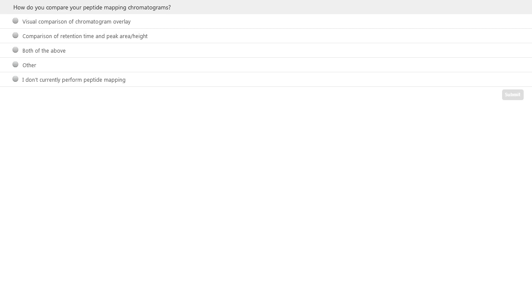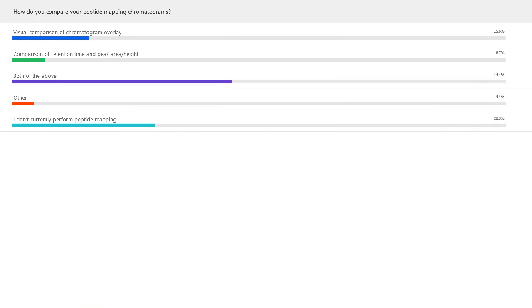Okay, so thank you. It seems like we have about three quarters responded. So it seems overwhelmingly that everybody uses both of the above techniques, which is encouraging. And Mauro, was that expected? Yeah, I would say so. It depends a little bit on the analytical lab, or the function of the analytical lab. I see the early development is mostly visual comparison, whereas down the line it is more based on retention time and the peak area. But it is as expected.